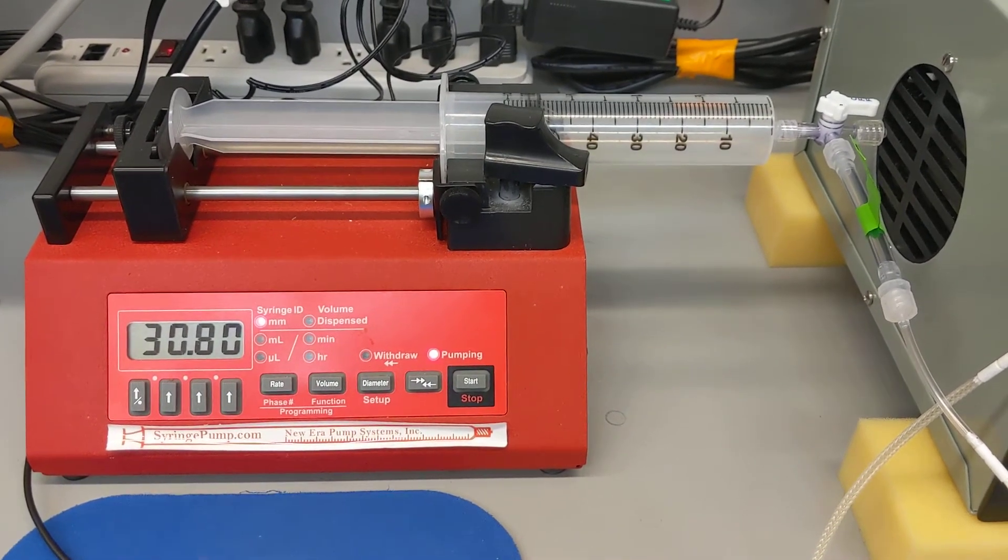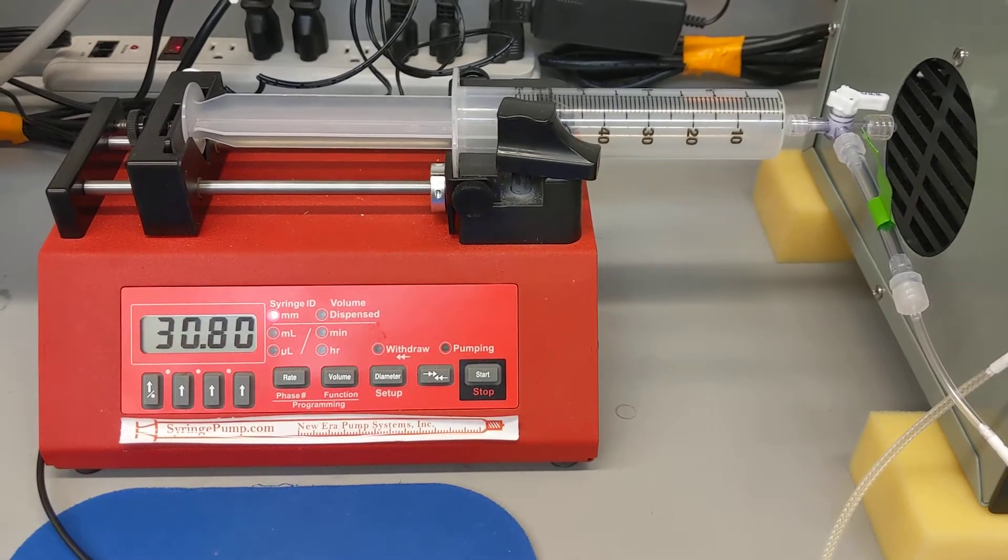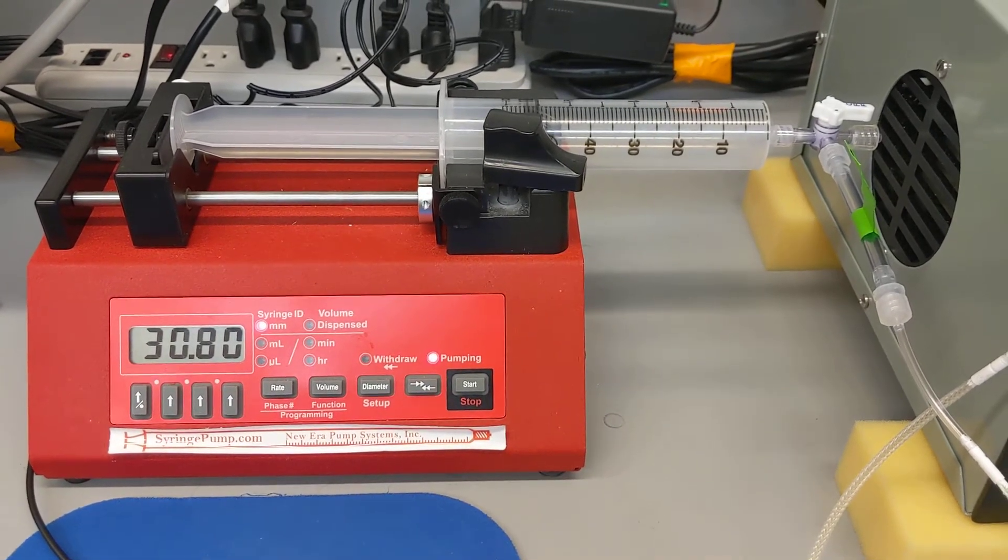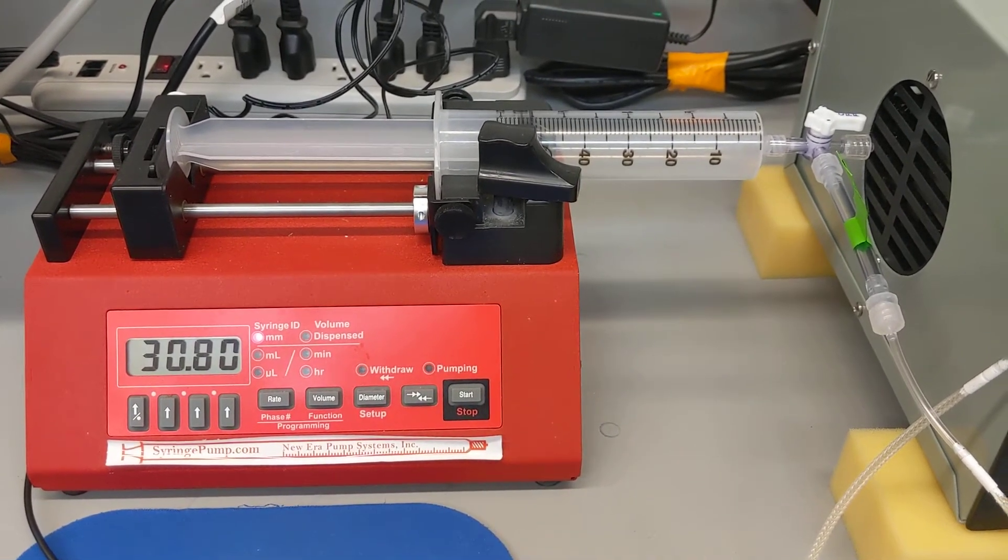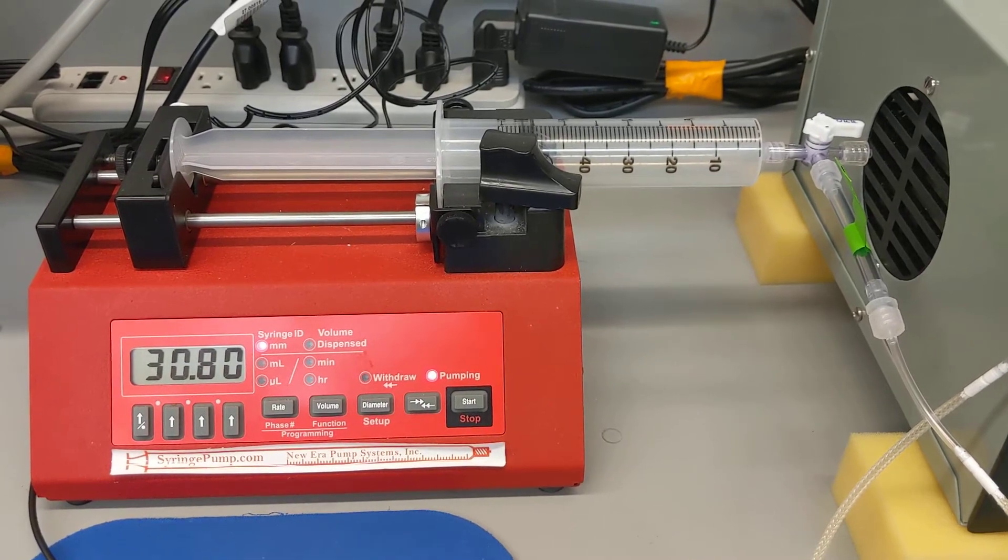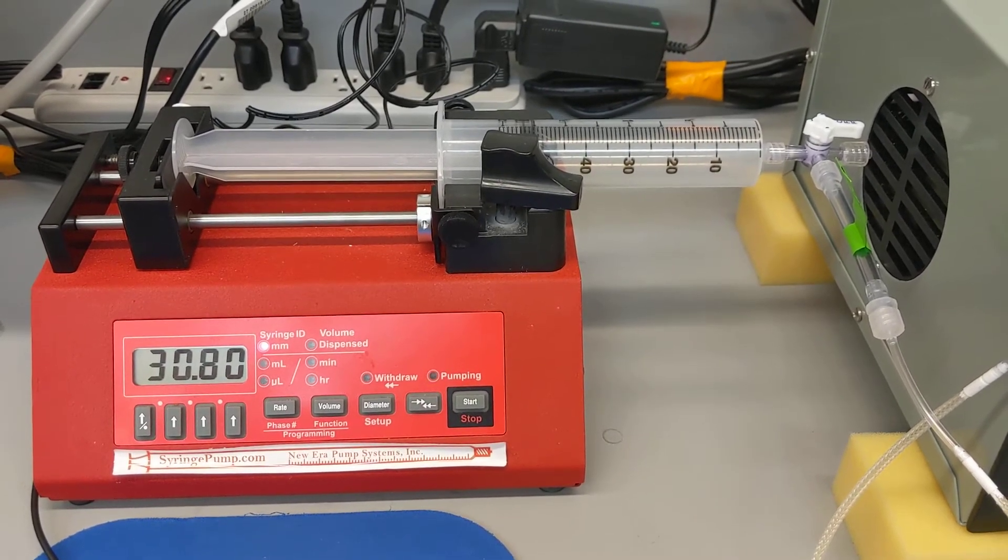So it's going to go through all that same machinery, and the rate of oxygen consumption is highly dependent on the rate at which the air sample passes through the system.